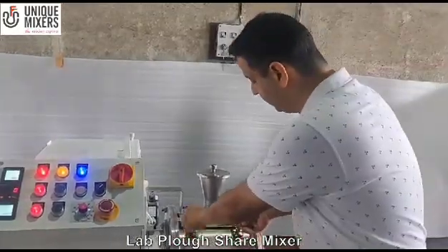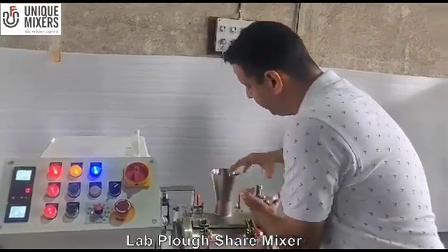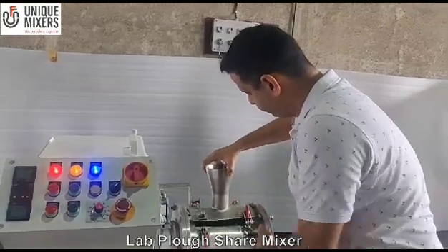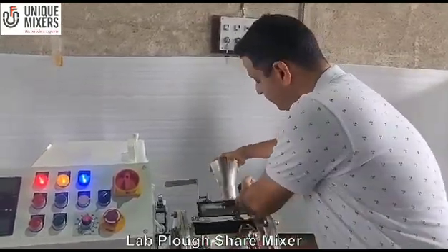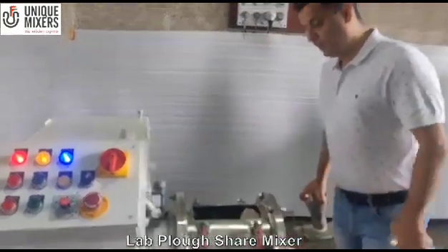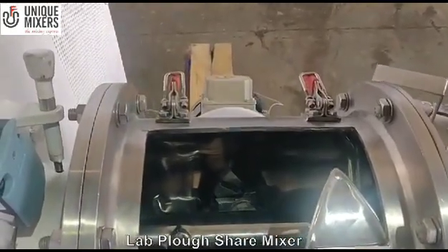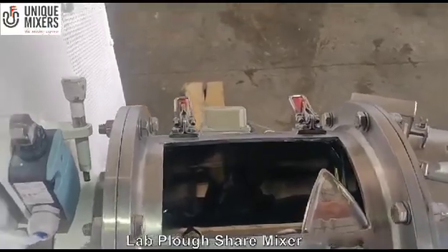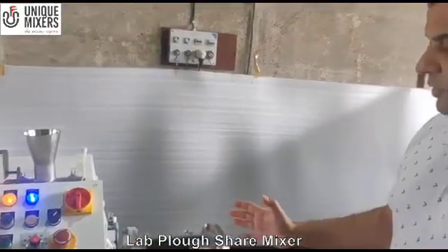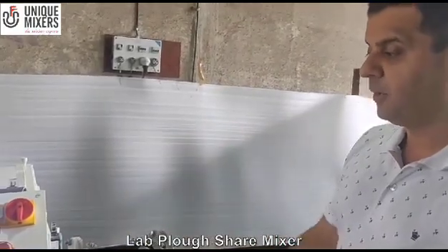The charging of the material is through the window which is opening here. As you can see, the mixing elements are plough-shaped and we also have a chopper assembly, which is designed to disintegrate the lumps and agglomerates in the mixing. It is a very compact design so that all the functions including the control panel can be operated.